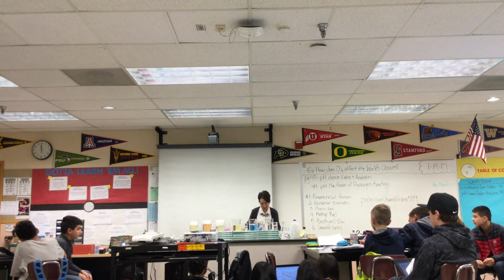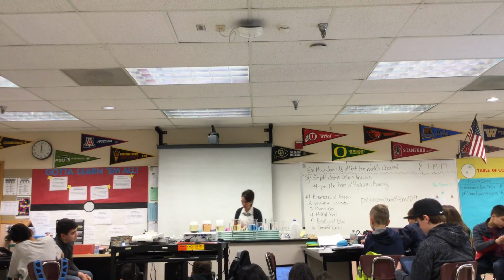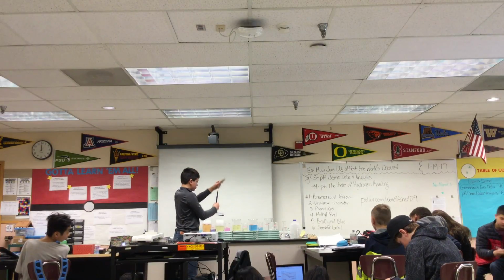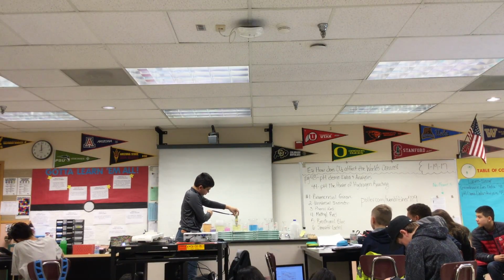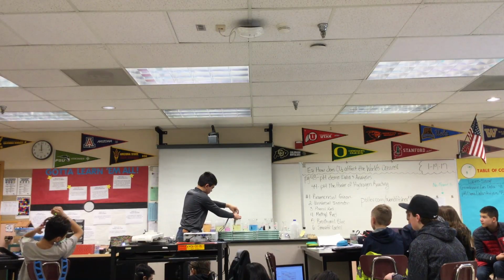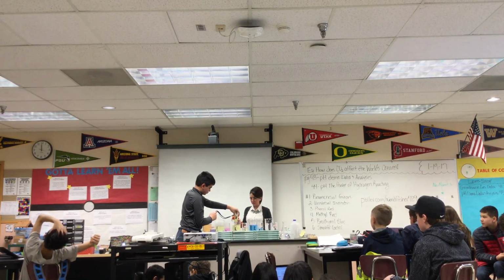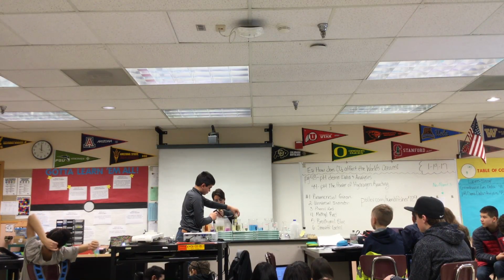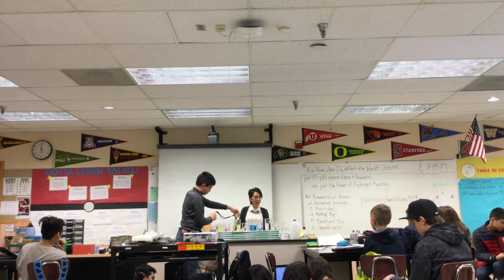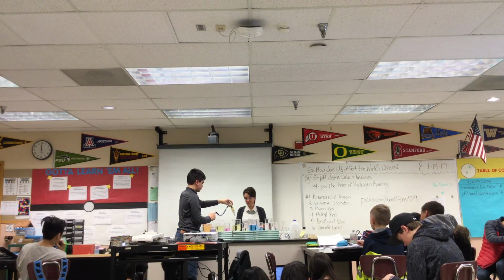So next we have methyl red. Right now, what color is methyl red? Yellow. Xander, do you want to find our pH of methyl red? We're gonna wait until the reaction is done, until all the dry ice has sublimed, to get the pH of the fuchsia. 8.4 for methyl red.